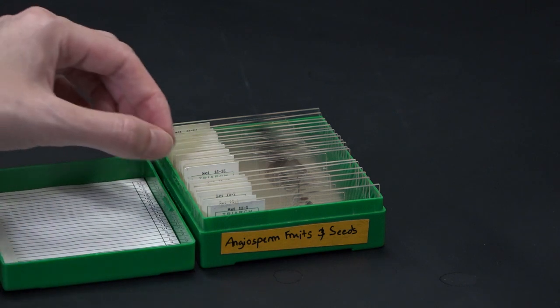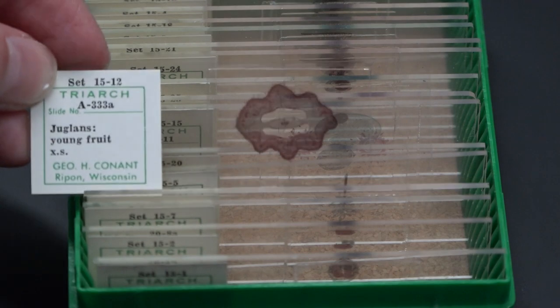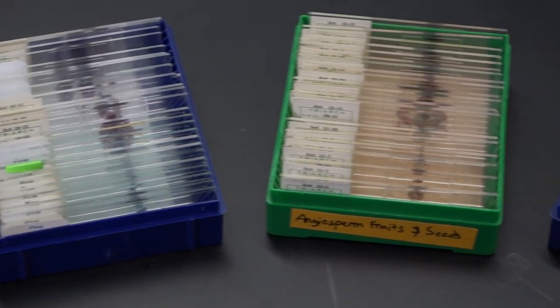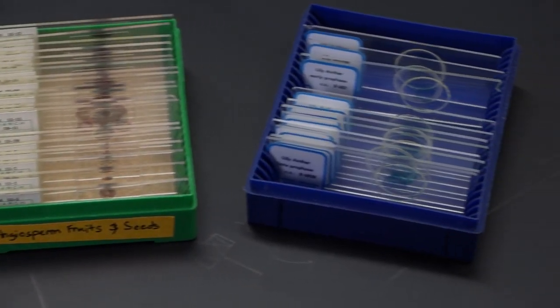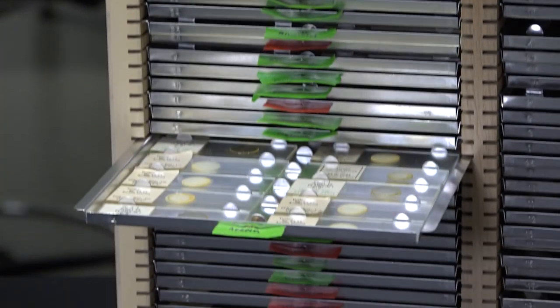Technology, we use microscope slides all the time to peer into the hidden world of all things teeny tiny. I still remember the excitement when my teacher would open a box of slides. What were we gonna see today? Mouse brains, insect antennae, sea creature guts, plant roots, bacteria, and protists.